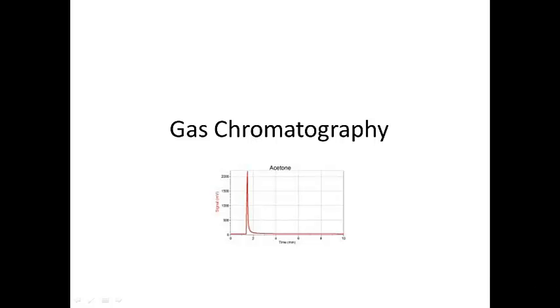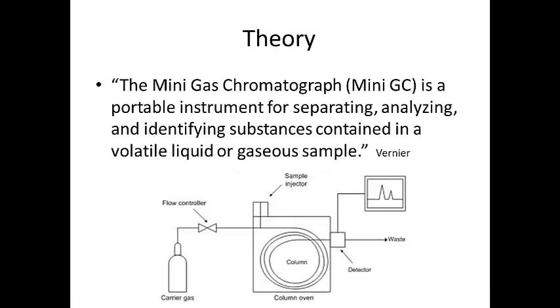This is the pre-lab video for gas chromatography. Chromatography is the separation of mixtures. We have lots of different types of chromatography, but gas chromatography is separating gases.